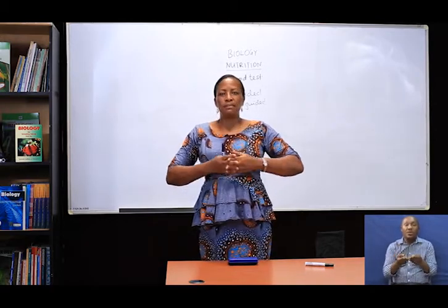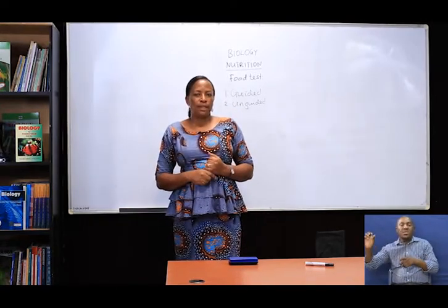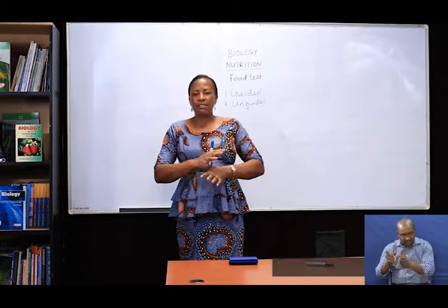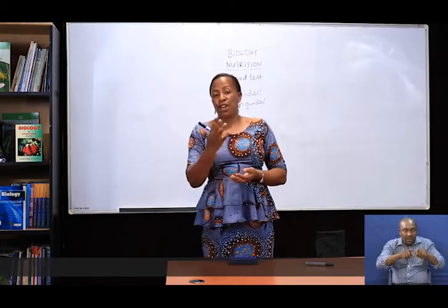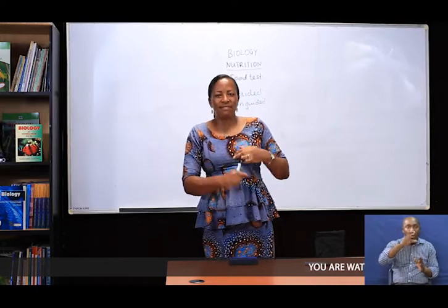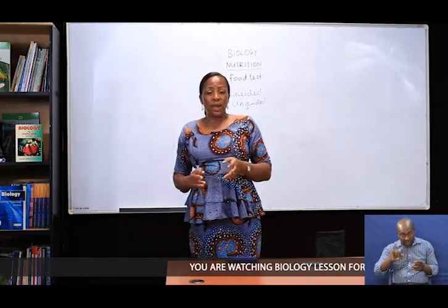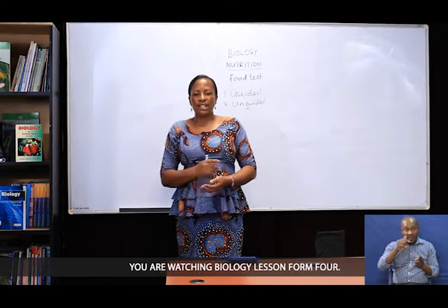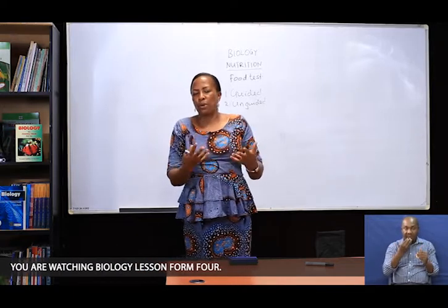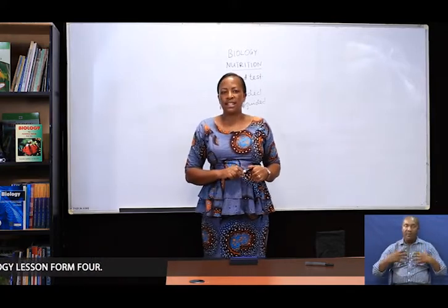The solution may be named maybe solution D, solution X, solution C. Your teacher or lab technician will prepare a solution from different food samples. I'm sure you know the groups of food. We have carbohydrate, we have protein, we have roughage, we have vitamins, we have water, and other types of food which comprise the so-called balanced diet, the foods that are used by human beings in order to be healthy or to maintain your health. Somebody is supposed to eat a certain kind of balanced diet.